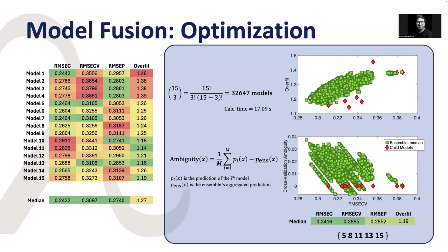We can start improving in cross-validation in that way. The one thing that I will say is that you could also plot, for example, the prediction ambiguity versus the prediction error. That's something that right now is not implemented, but it can be done. So you can make sure that you have those two plots, just like we do with the output of Diviner.